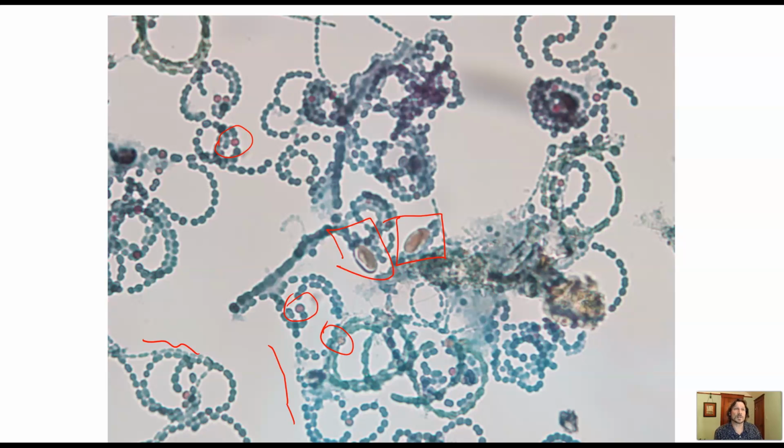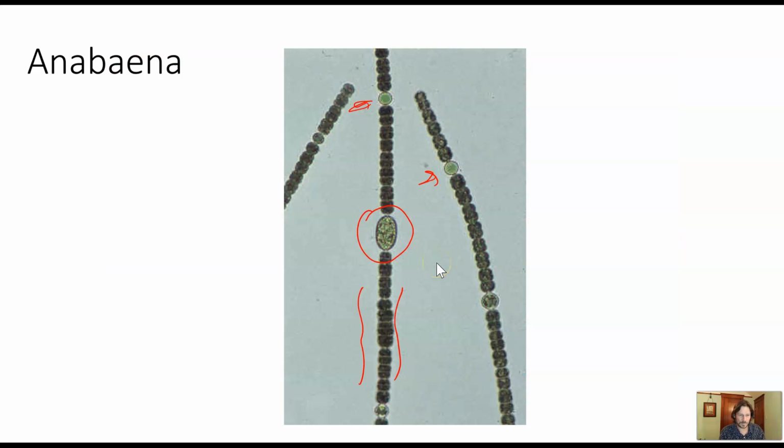And so if we're in lab and seeing it in a test tube, it'd be settled down at the bottom, kind of in a dark clump, because when they ship, they all coalesce together. And then you put your pipette in and you stir it up, and then they spread out. So the whole thing looks like it's bright green water, but when you put it on the slide, that bright green is really little strings in the water. So it's kind of neat to do that when we see the fresh stuff. This is the fresh one that I already labeled for you.